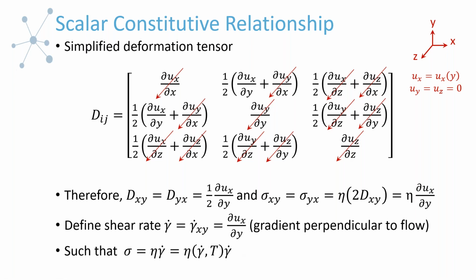And this, of course, is open to the possibility that the viscosity is going to be non-Newtonian. In case you're not familiar with that, Newtonian viscosity is one that is independent of shear rate, and non-Newtonian is one that will vary with shear rate. So the resistance to the flow will vary with the flow field, essentially. And of course, you can have a dependence on temperature as well.